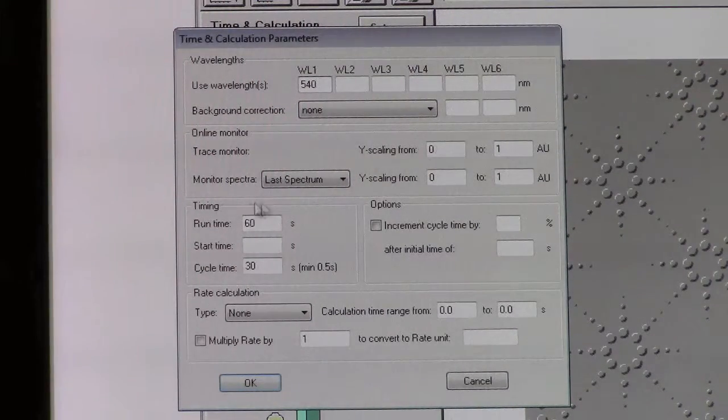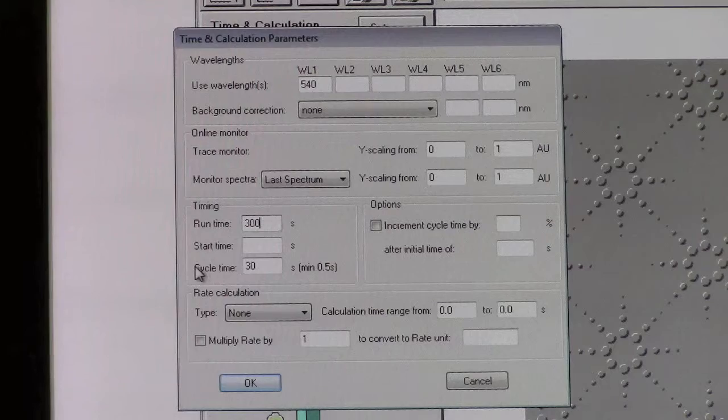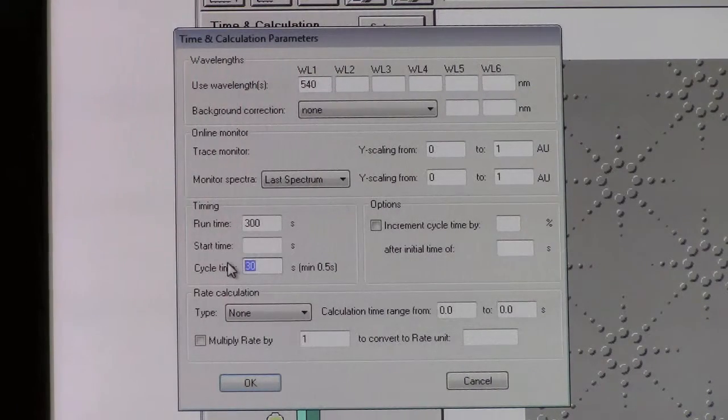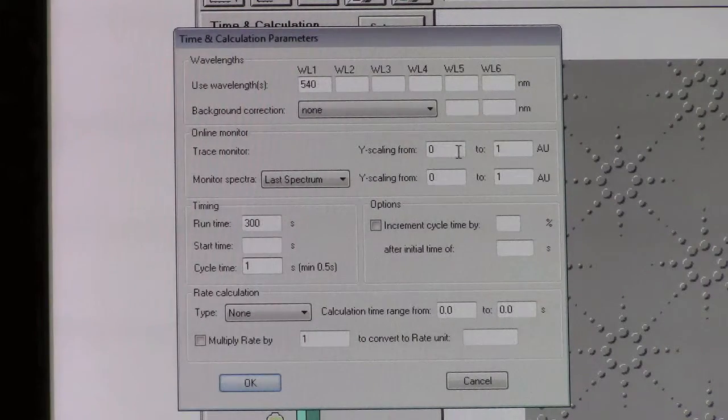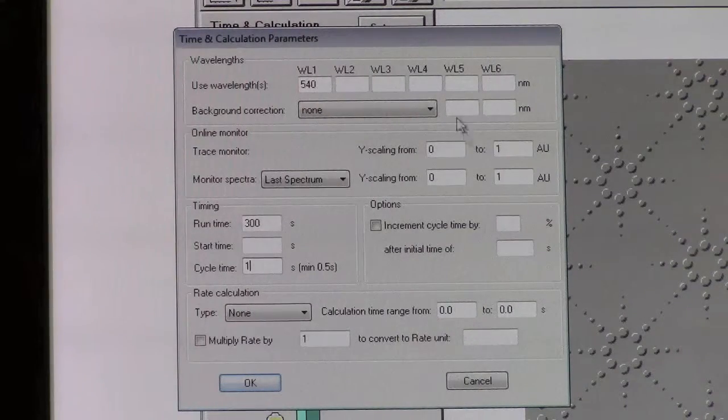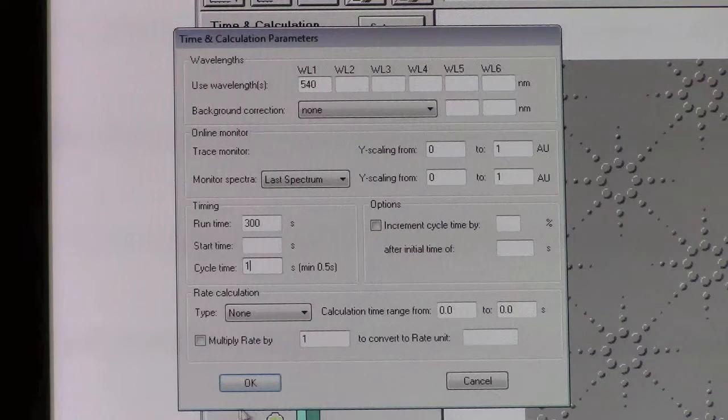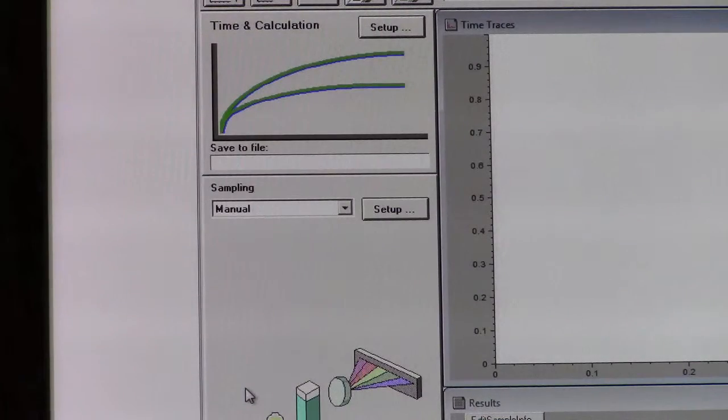You'll also need to set up the timing, which is further down to the left. Set the run time to 300 seconds or 5 minutes, which should be more than enough data, and set the cycle time to 1 second, so a new spectrum is taken every second. This is essentially the sampling frequency. All other parameters can remain the same. The scaling from 0 to 1 absorption units is fine given the materials. Click OK to complete the setup.